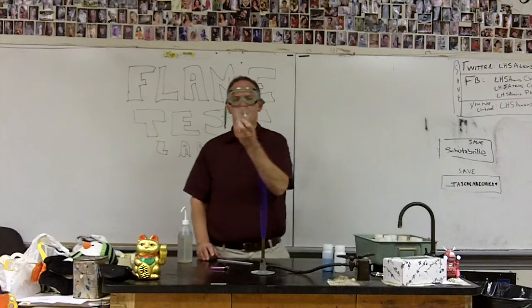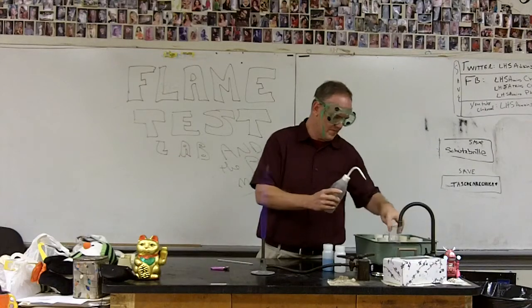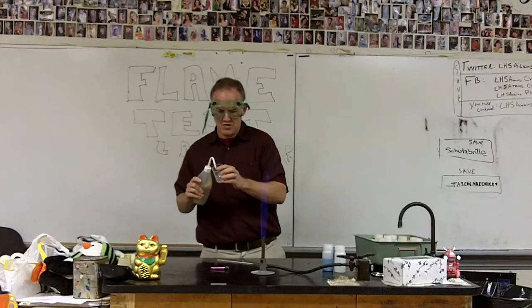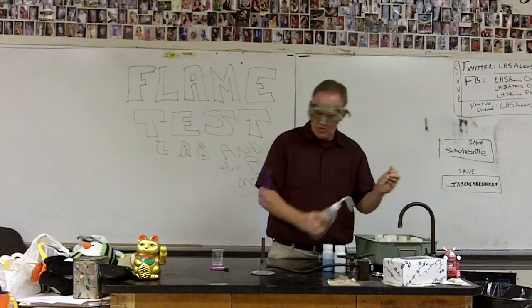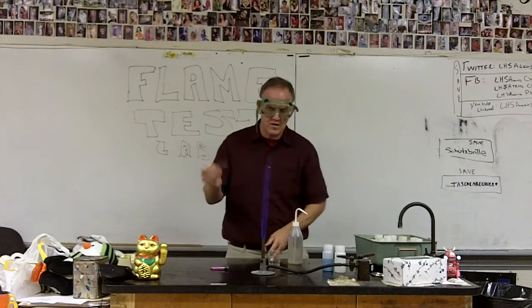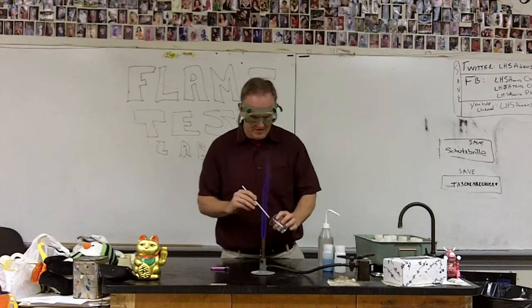First thing you want to do is get a small beaker — the 100 mL or the 50 mL will do — and rinse it out with some distilled water from your distilled water bottle. Make sure it's nice and clean. If we have any impurities in this water, it's going to mess up our colors as we do our flame tests. We also want to rinse off our nichrome wire as best we can using that water, and then clean it in the fire.